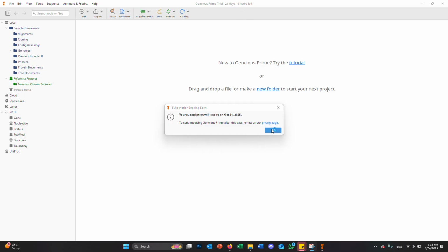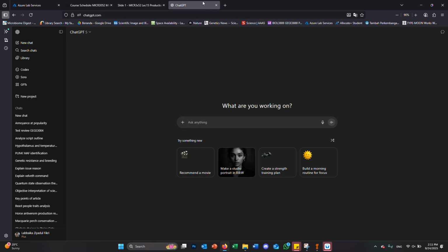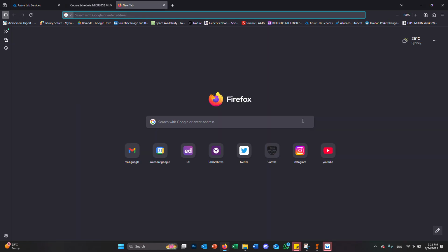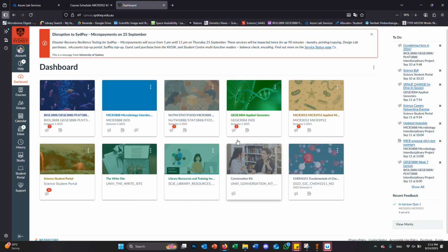flow cell that Scott and Jacob helped us to load and prepare. And then it sat there for 42 hours because I didn't come in to work the day after. I just worked from home on the Thursday, so I let it run. 42 hours. We got a lot of data out of this.